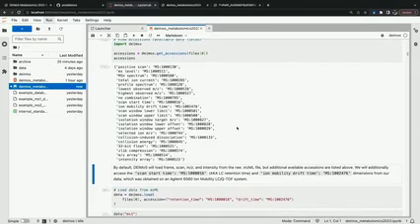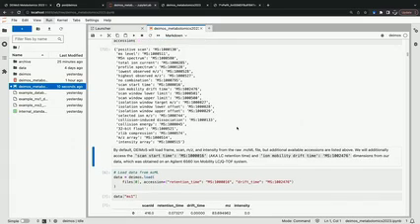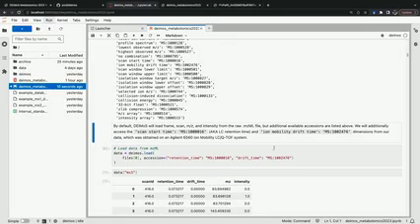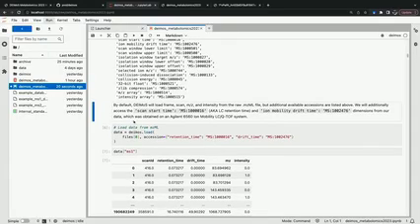Here, this is LC-IMS, MS data. And so we are interested in grabbing the drift time and retention time dimensions. I think m/z is grabbed by default by DEIMoS. And so here, those happen to correspond to the scan start time is the LC retention time dimension, and the ion mobility drift time dimension has the succession.